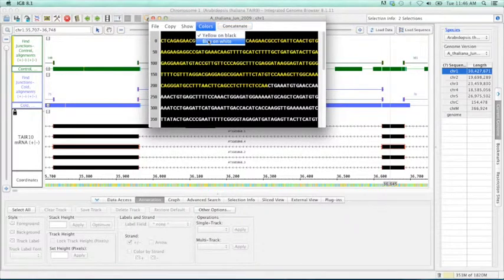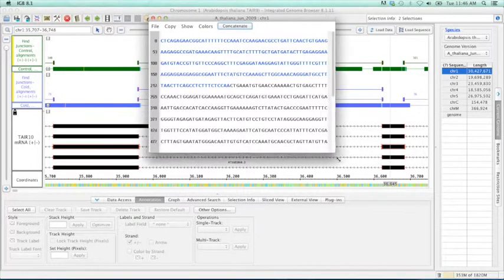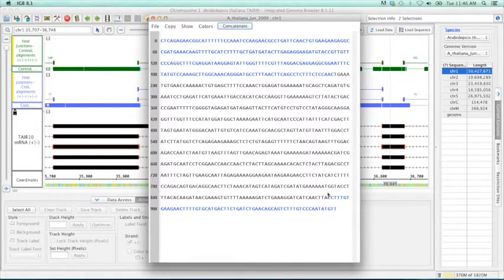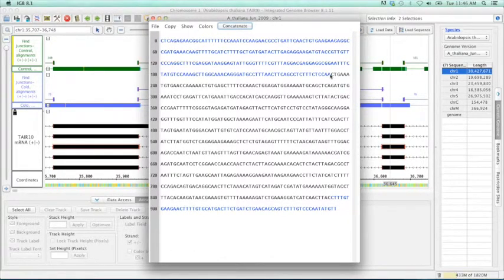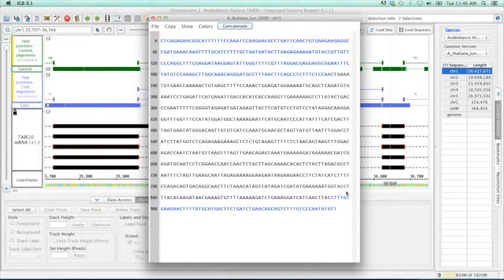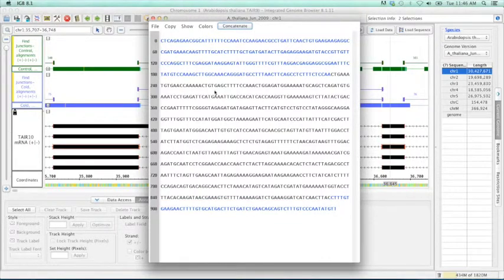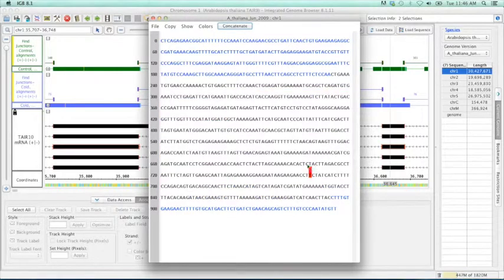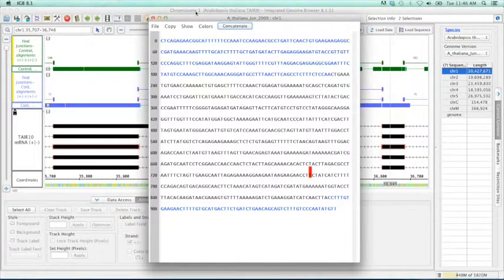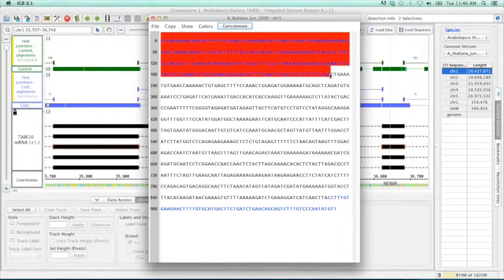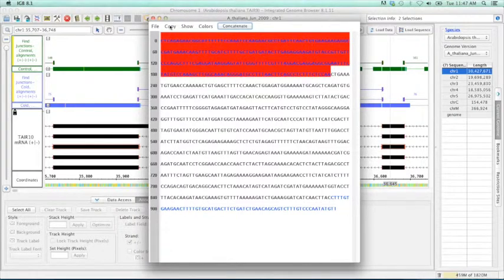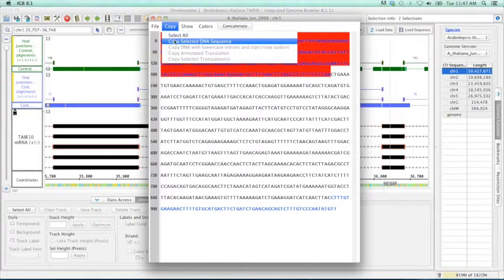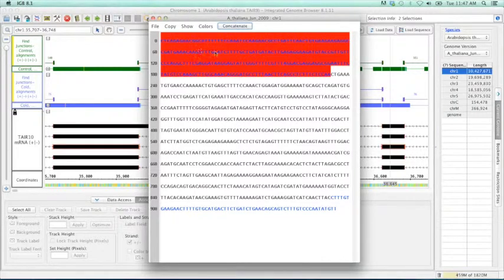Now I'm just going to change the color really quick. What we can see here, IGBI has highlighted in blue our two flanking exons with the intervening sequence here in black. In order to design primers around this, what we want to do is select this exon. I'm going to go to copy, copy selected DNA sequence. Now I'm going to jump to a separate program.